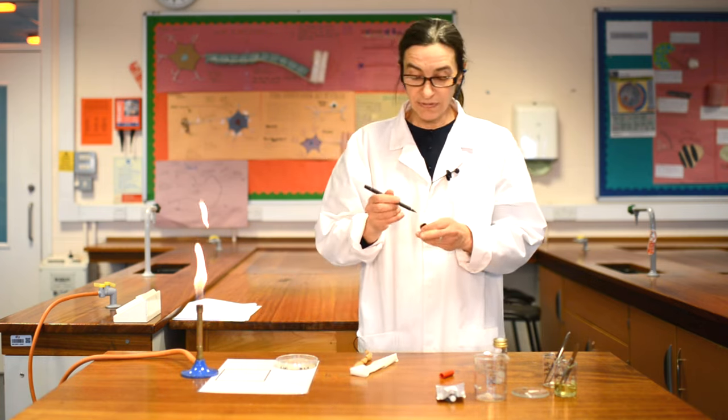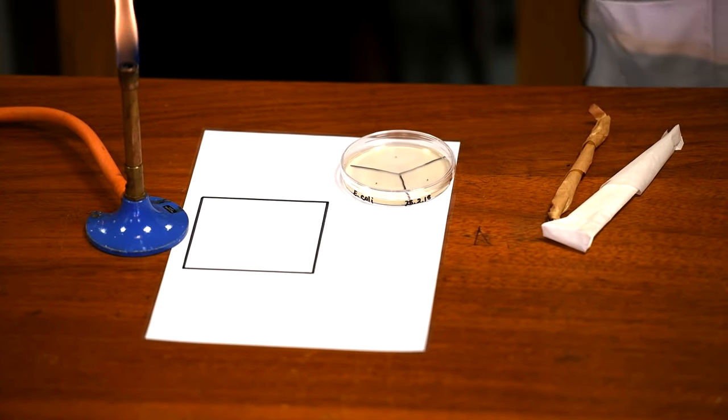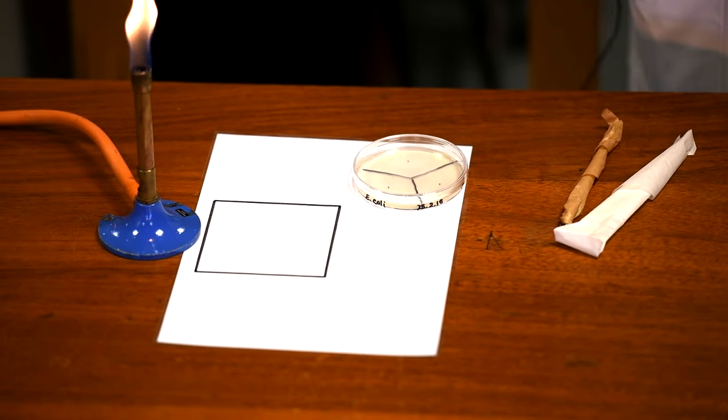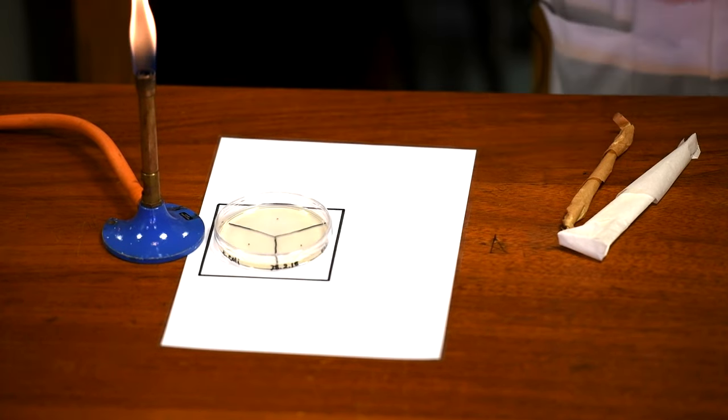And now you can put your plate down, lid up. You might have heard before that you should always store them upside down, but we're not actually going to store that plate for very long. We're going to leave that plate lid up for now because we're going to be working on it and we want to place it into our area.